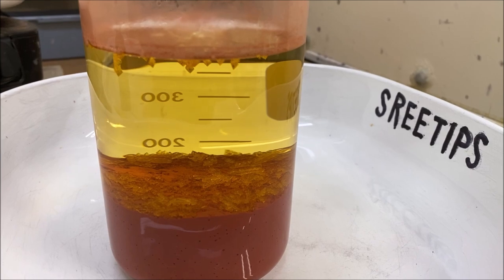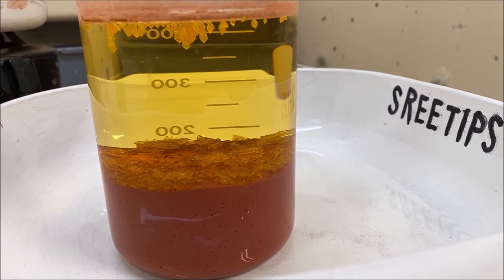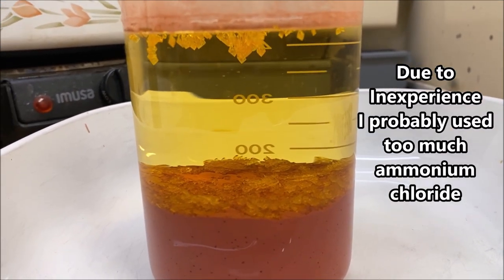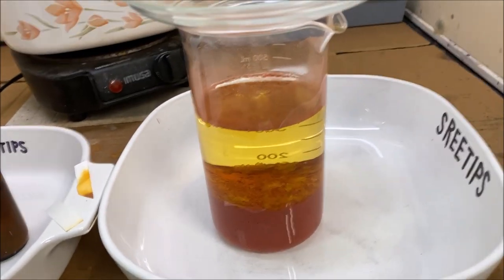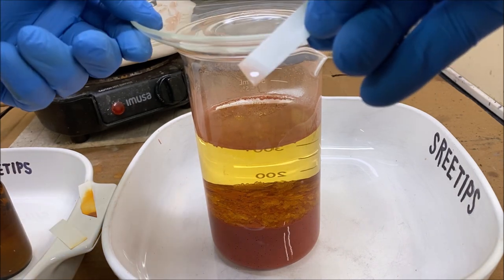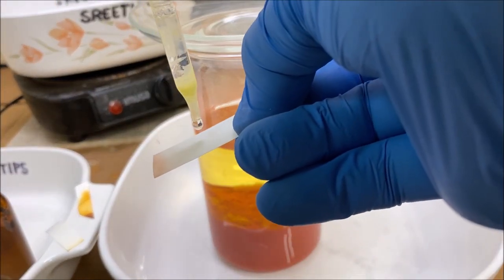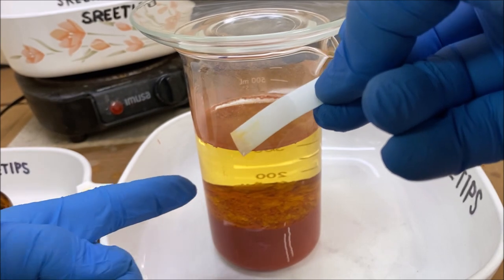Welcome back to part two of our platinum refining series. Here's our precipitate that we got in part one - there are some crystals coming out of solution, probably ammonium chloride. We're going to reach in here - you'll see the solution has a little color to it - and get a little bit on a filter paper and do a stannis test. It looks like we've got a little bit of platinum in solution.